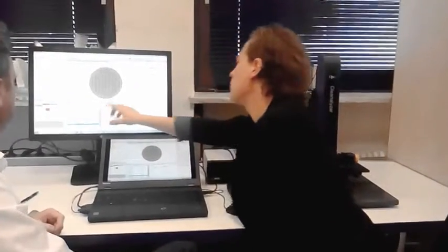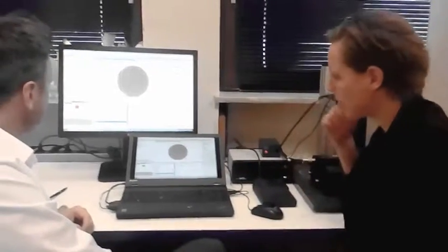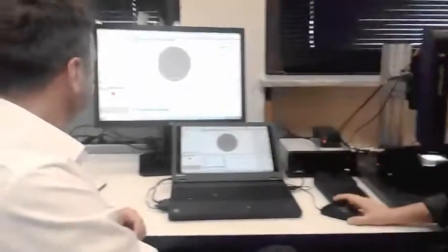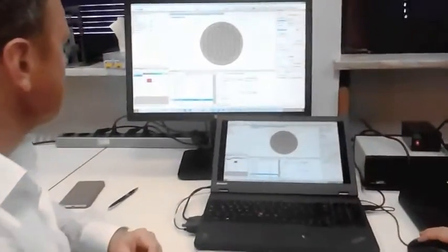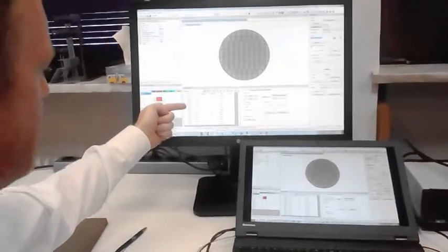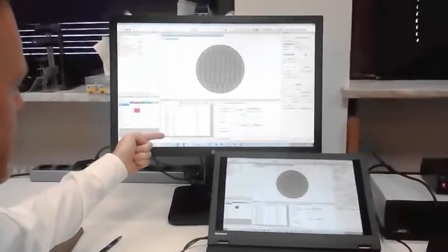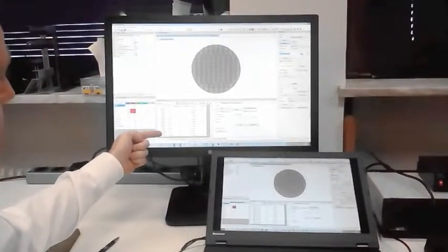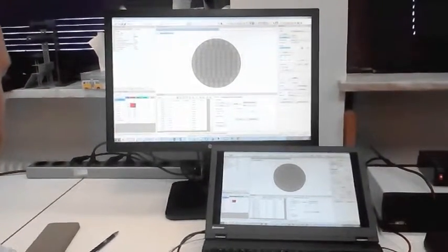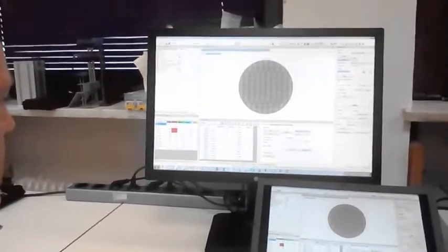Here is the most interesting part, because here we can see all metals or all particles that have been detected. So how many particles is it actually counted there? I noticed that every particle has an ID number now, every single one. And you can see 2,513 particles we've counted, is that correct? That is correct. Yeah. You can see it here, and you can see it in this window.